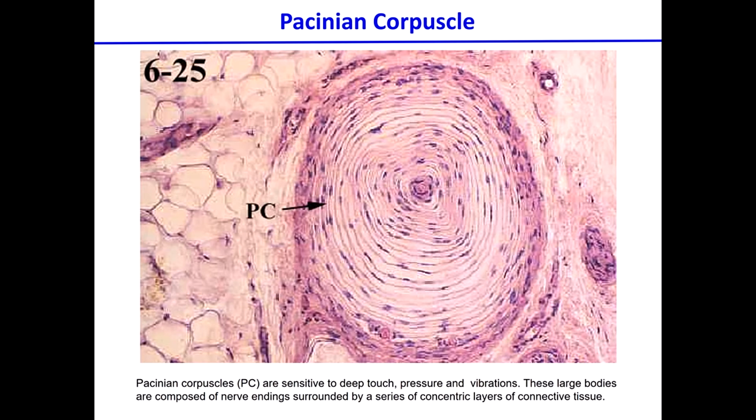All right. So what this means is that this kind of fibroblast-like thing is sticking around, and each of them has its own nucleus. If it was a section of a myelinated neuron, as I pointed out before, you can actually see the body of the Schwann cell that will be wrapping around in a structure of this kind. Questions?